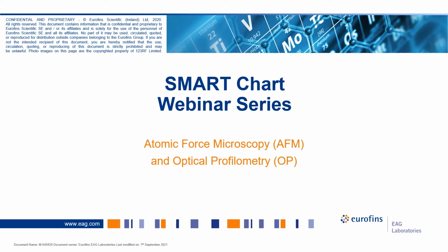Good morning, good afternoon, or good evening, everybody. And thanks for taking the time out of your day to tune into our Smart Chart webinar series. Today, we'll be covering atomic force microscopy and optical profilometry, which is also known as white light interferometry.